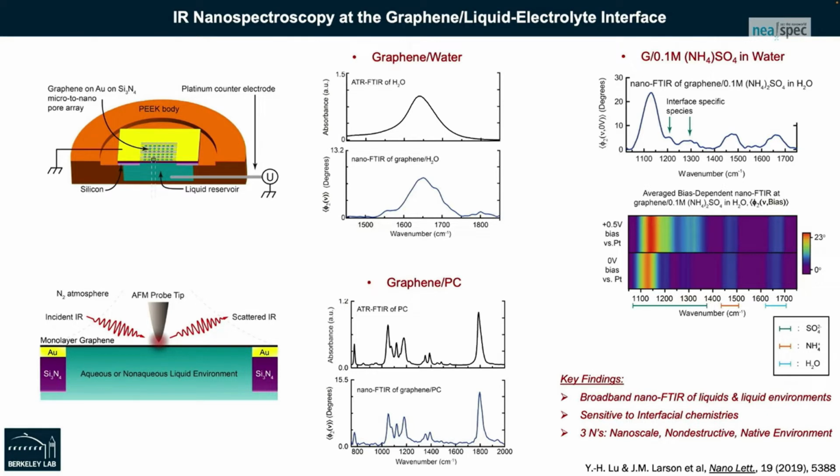But then what was really cool was we moved to a salt-rich solution, a basic salt-rich solution, one that would afford us the opportunity to investigate an interphase, or a region at the interface, that was different from the bulk.